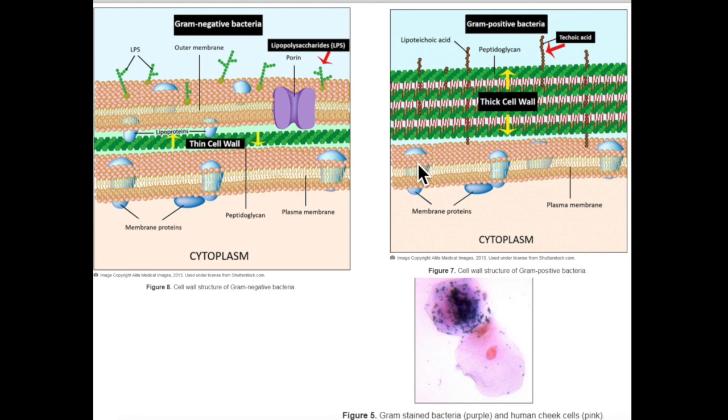Over here, we're also going to have the crystal violet binding to negative structures down here on the cell wall. And so crystal violet fills up this area as well. When we wash it, any extra that's up above goes away. We then add iodine, and the iodine goes into the same places as the crystal violet. What we believe happens is that molecules of the crystal violet will bind to molecules of the iodine, and the iodine will kind of go all around it and make this larger complex.